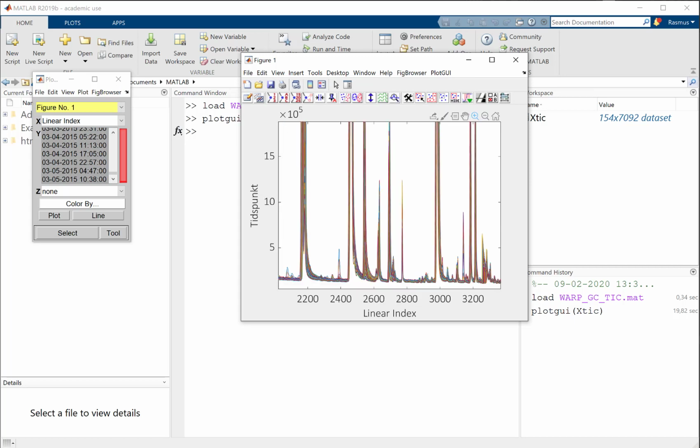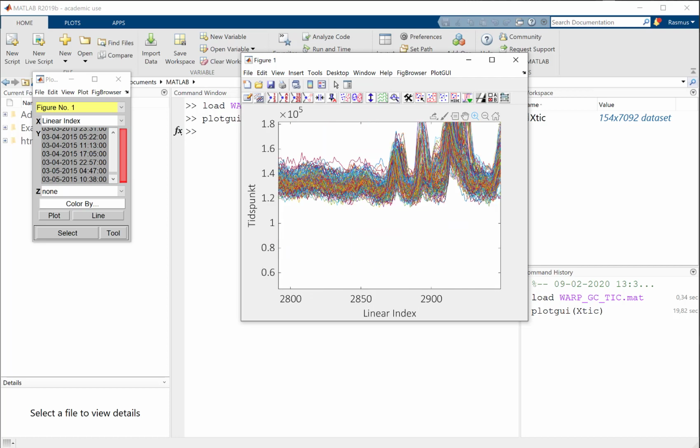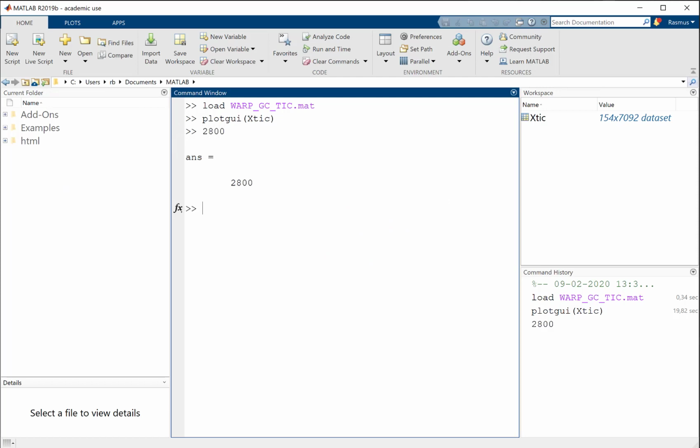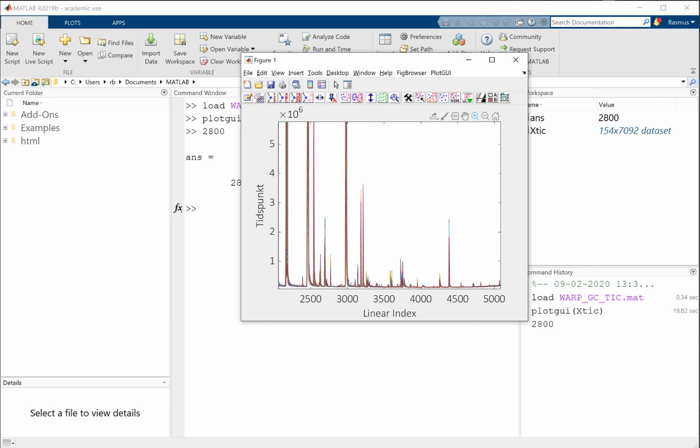let's do something like this. Maybe I'm gonna start here. So around 2800, let me write that down. 2800, and how far should we go?